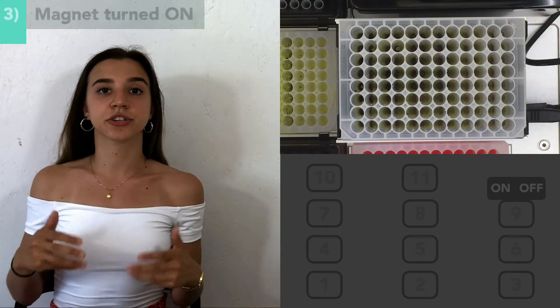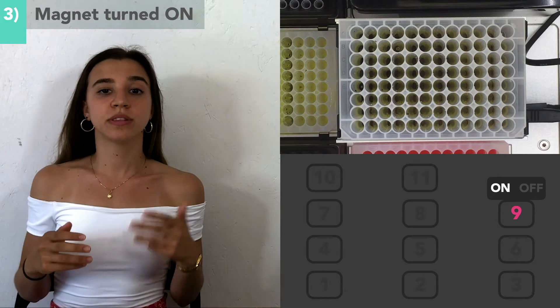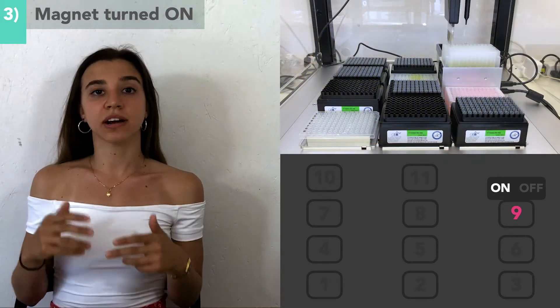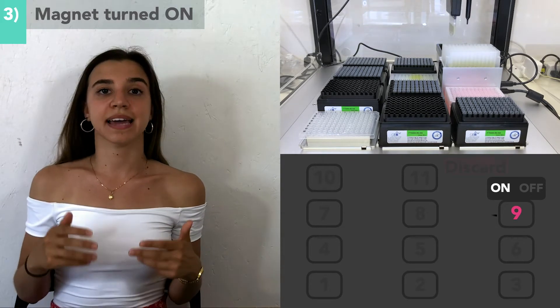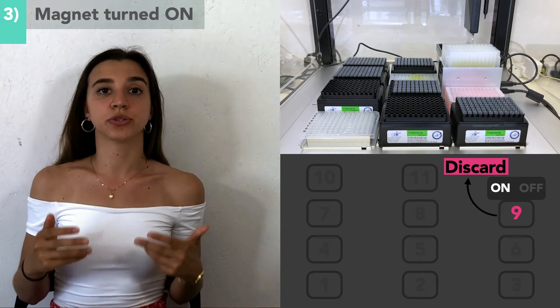At this point, the magnet is turned on. The magnetic beads will subsequently be pulled to the side of the well where the magnet is. While the magnet is on and the beads are held in place, the supernatant can be removed and discarded as all the RNA will be bound to our beads.